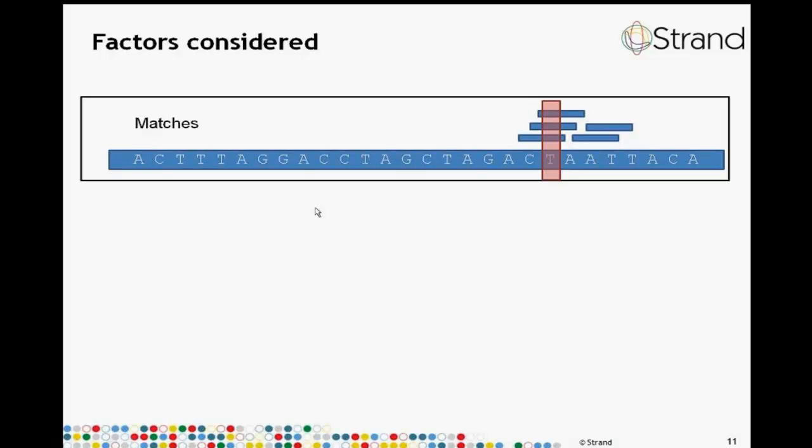As I mentioned earlier, when we want to do SNP calling, the SNP caller is going to essentially go to each location along the reference, consult the reads which are overlapping that particular location, and take the base quality, the mapping quality, and number of reads into consideration before making a SNP call.